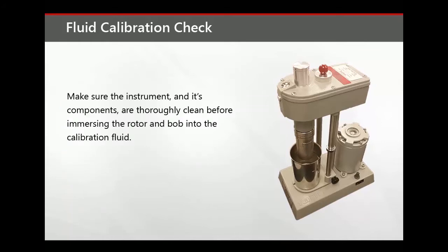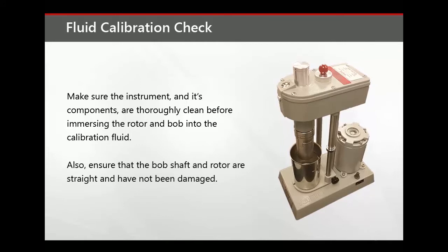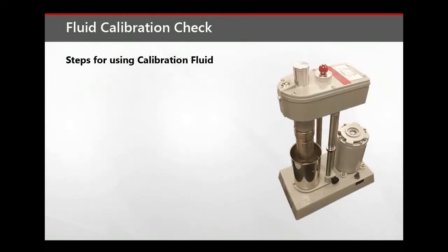Make sure the instrument and its components are thoroughly cleaned before immersing the rotor and bob into the calibration fluid. Also ensure that the bob shaft and rotors are straight and have not been damaged. Perform these steps when using the calibration fluid check method.